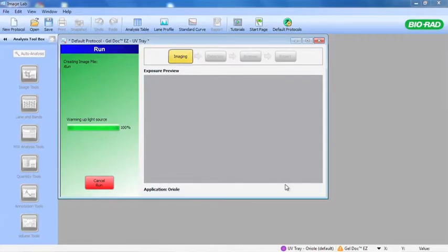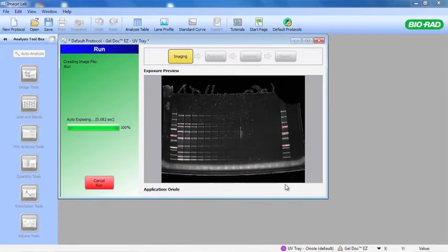There's no fussing really with zoom and focus. It automatically does most of that and sets the exposure, and the images are great.